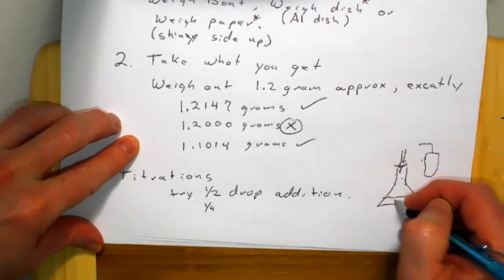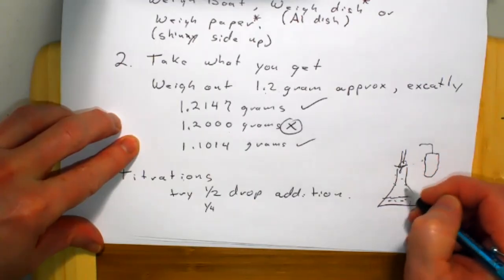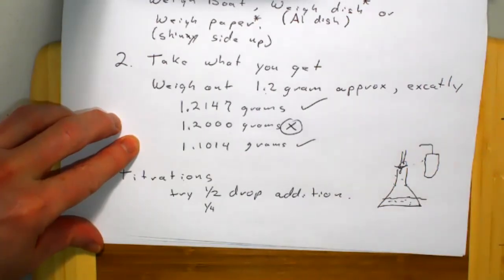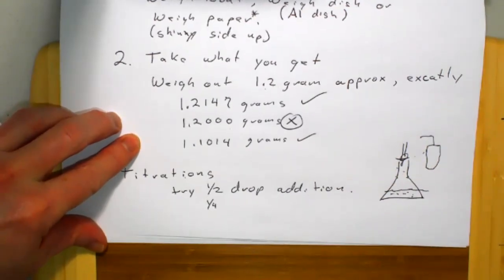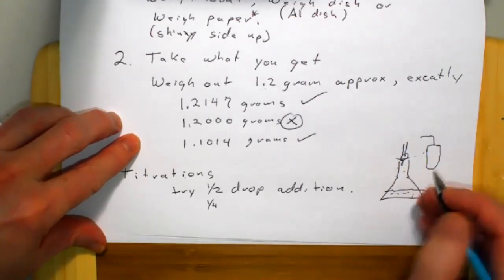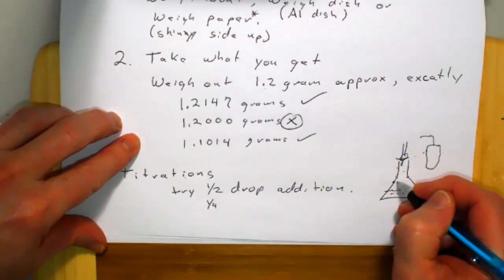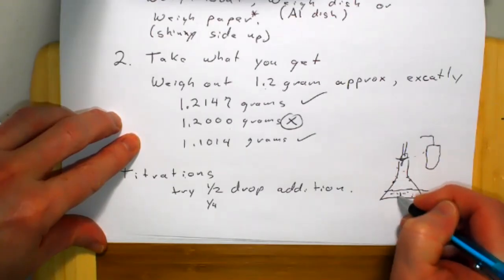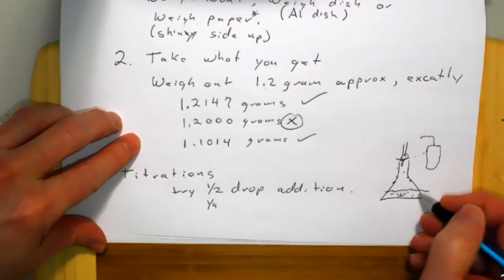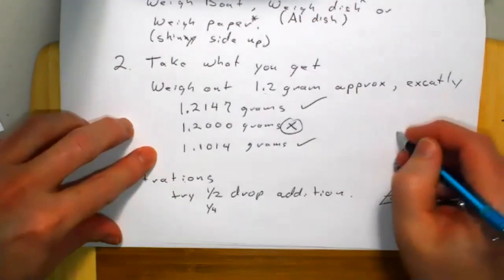Let's say it looks beautiful. Oh, it's beautiful. Add some water down the side. See if that's the truth. Don't try to impress anyone with how good it looks. You want the truth. It might look real good, but there's some drops stuck to the side from the stir bar. Rinse those babies down and see what's really in there. So always rinse near the end.